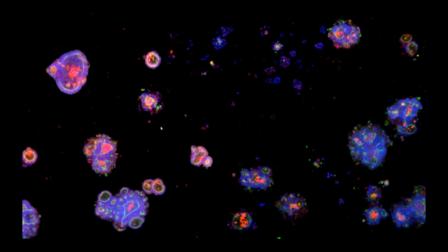And then I will end up with a quick overview of automation solutions. One of the features with multi-parametric phenotypic readouts is that you will be swamped by lots of data. And so here is an example of a screenshot of one of my data tables. High content screening can give you lots of information, and if you were imaging your organoids at high magnification, you would be able to at least to some extent extract single cell features to describe the observed phenotypes.